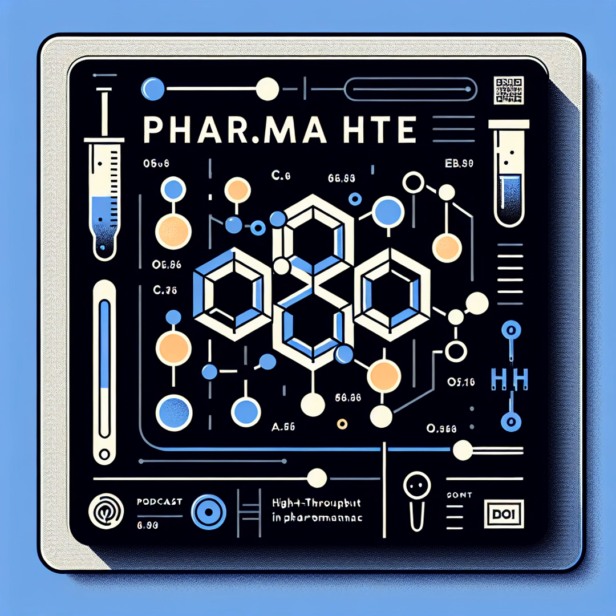I'm your host, Matthew, and today we're diving into the fascinating world of high-throughput experimentation, or HTE, in pharmaceutical development. This isn't your grandfather's chemistry lab, folks. The pharmaceutical industry is under enormous pressure to deliver new drugs faster and more efficiently, and HTE is playing a crucial role in making that happen. It's a powerful combination of automation and clever experimental design, basically supercharging the way we discover and optimize chemical reactions for drug manufacturing. Think of it as a highly efficient, automated approach to chemistry.